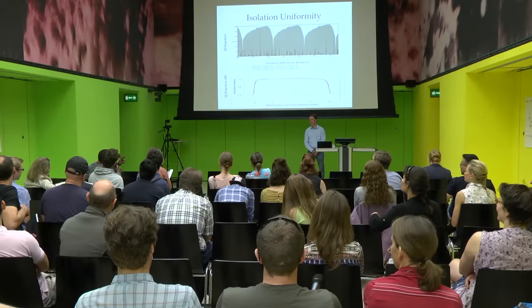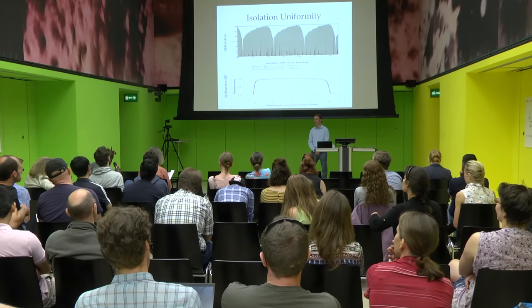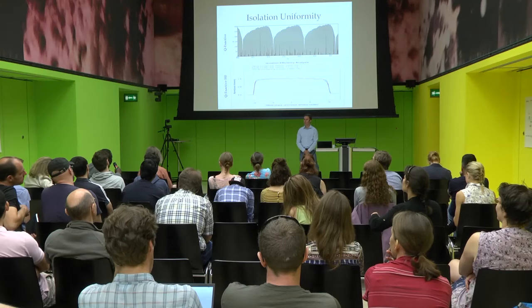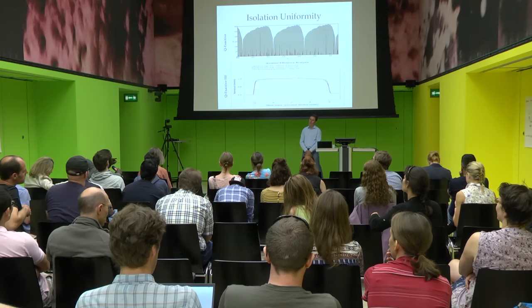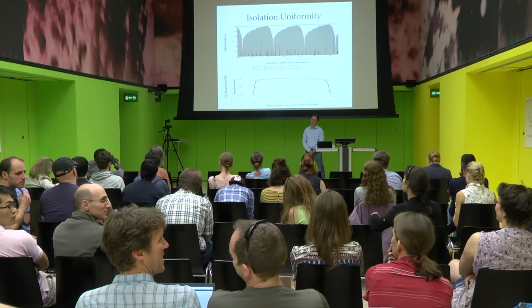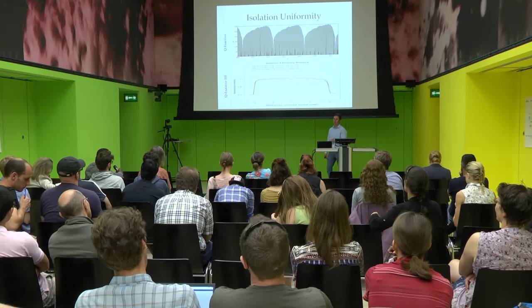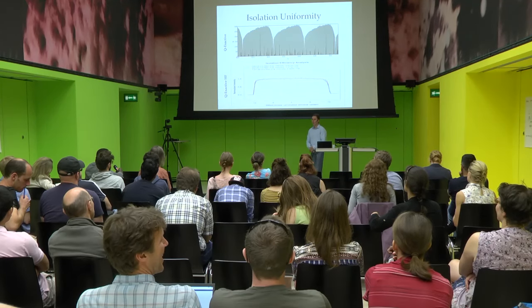Question: to avoid the separation between the first isotope peak and second one, why is it possible to overlap scans? Correct, and that is the approach that Ludovic took in his manuscript defining the SWATH approach, and it is a very common approach.